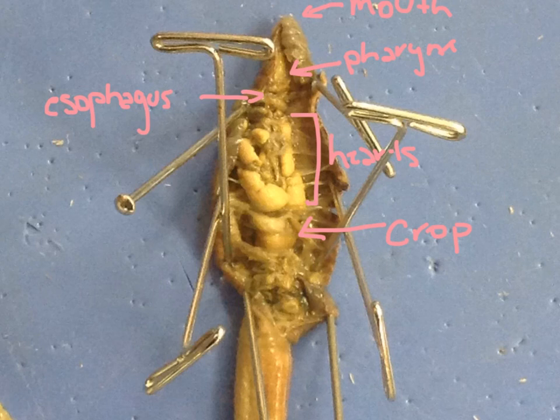After that comes the gizzard. The gizzard grinds the food. Lastly comes the intestine. This transports nutrients and soil through the digestive system.